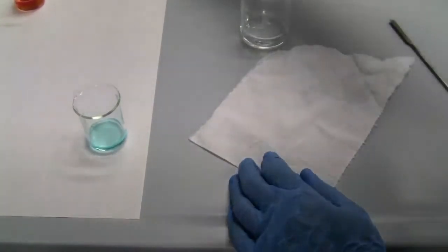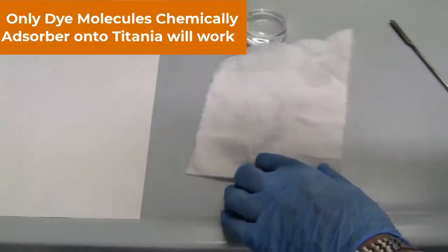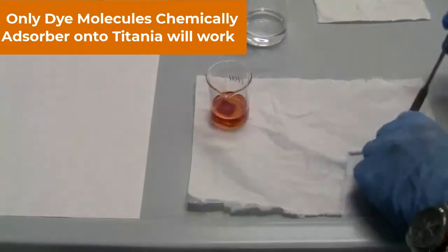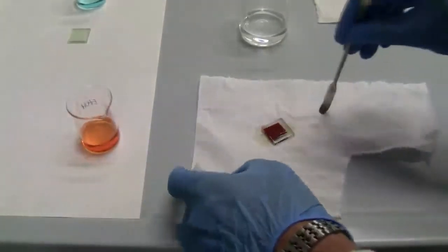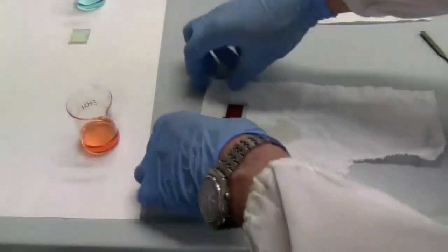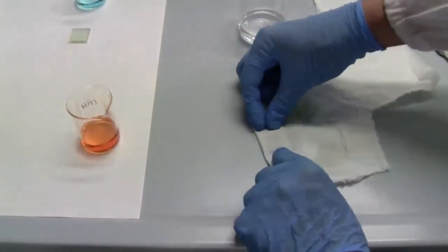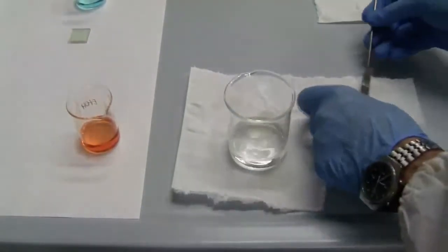The scope of this last operation is to remove the particles or the molecules of the dye which are not sticking and are not attached directly to titanium but simply adsorbed, because these are not working for the DSC. Only the molecules that are attached firmly with the carboxyl group onto titanium will be able to inject electrons for the DSC performance.